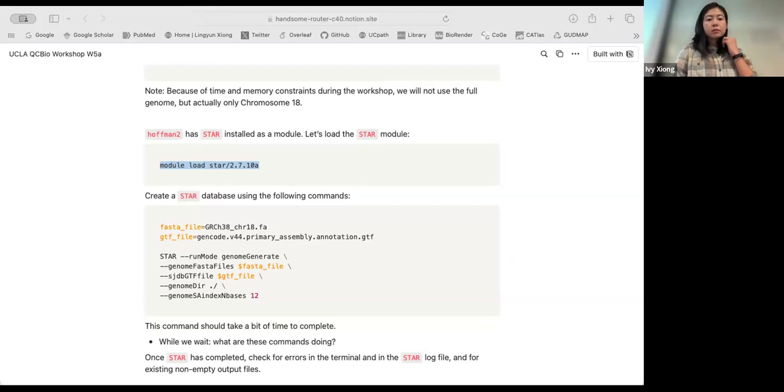No, it's not making a genome, just organizing the genome. Make sure that you know where to look. If you're more organized, it's going to be more efficient.